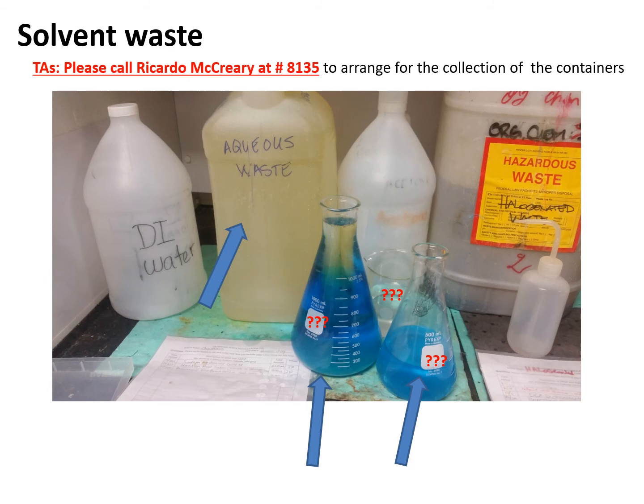Also, you see a couple containers with some type of blue liquid and clear liquid. They're not labeled. No one knows what they are. Are they someone's reagent? Is it waste? Who knows? Can't have anything unlabeled in the waste area. So there's some issues there.